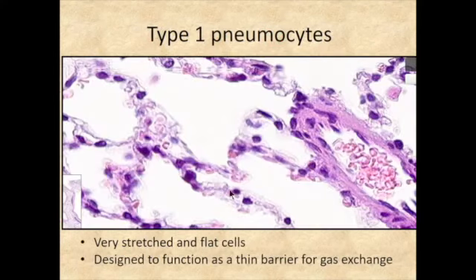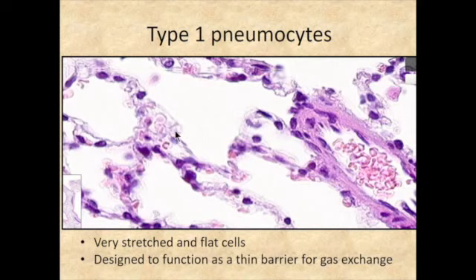The type 1 pneumocyte — here's a nucleus, sort of stretched out. You definitely have a type 1 pneumocyte along the entire border. Even if you don't have a cut through the nucleus, its cell membrane is still there. That is the cell that oxygen and carbon dioxide is going to pass through after it comes out of the endothelial cell lining the capillary.